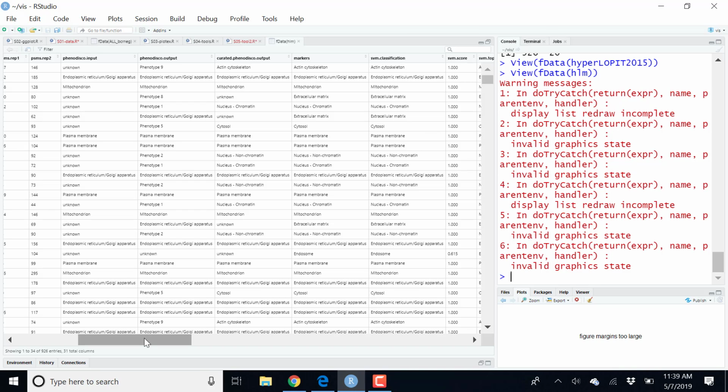And what we would like to find out is something like this, for example, where we have an average measurement of all the proteins that are in the black class, an average measurement of all the proteins that are in the white class, and an average profile of all those that are in the striped class and in the dotted class.